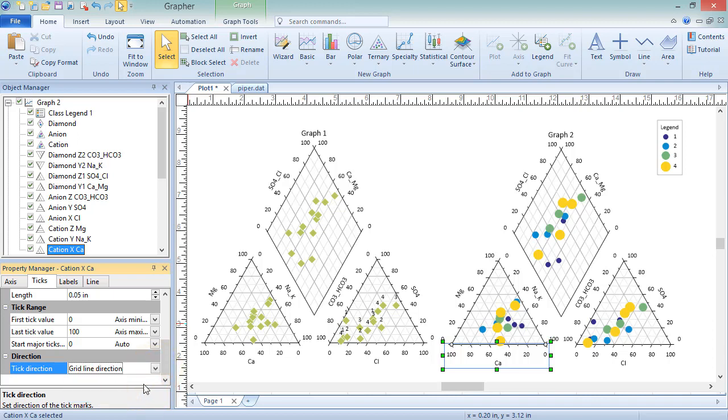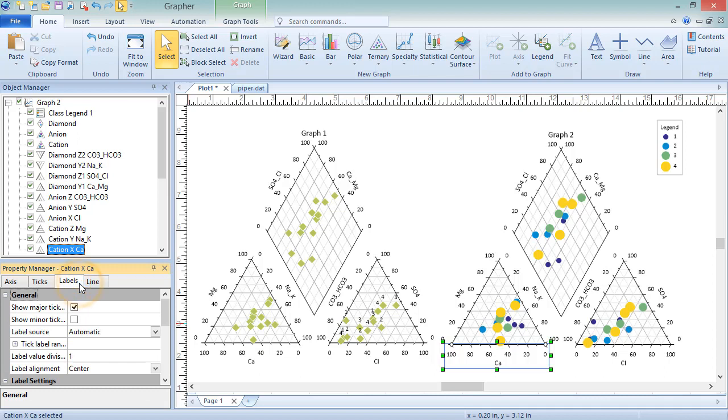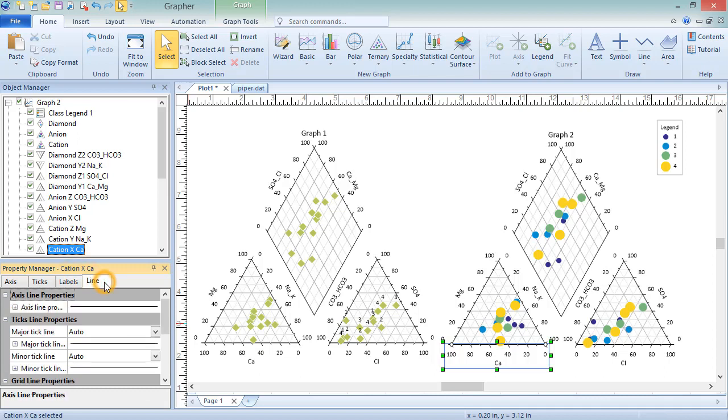On the Labels page are properties pertaining to axes labels. And on the Line page are line properties for the axis, ticks, grid lines, and label leader lines.